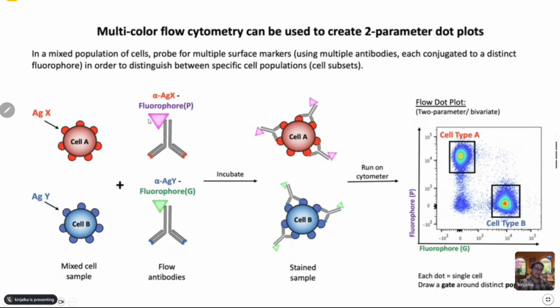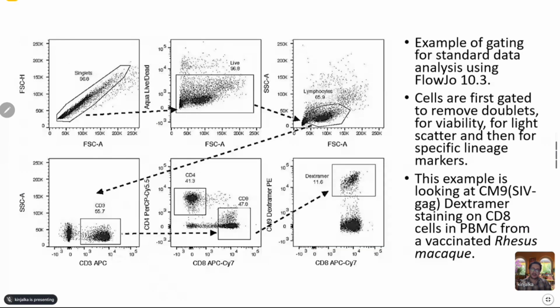Now, after identification, you can do multiplexing using different colors, with different antibodies, and you incubate and take the reading. You will get different fluorescence at different sites, identifying different kinds of cells. Sometimes we want to use multiple antigens for co-localization. We want to see if these two cells are together or nearby. So when you are doing imaging cytometry, this helps.